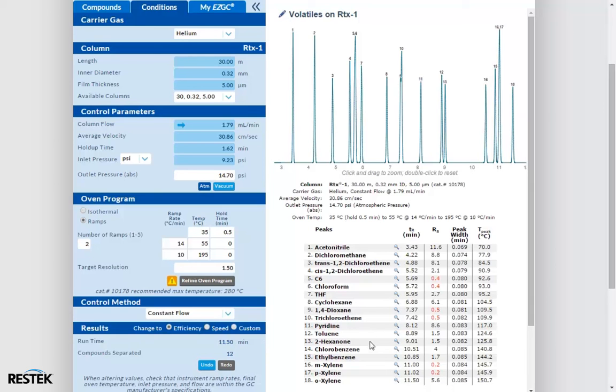This means that the software was not only able to fix the loss of resolution, but it also came up with a faster result than we would have gotten from using translation alone. Moving up from the radio buttons, we can see that above our program, we have our outlet pressure.